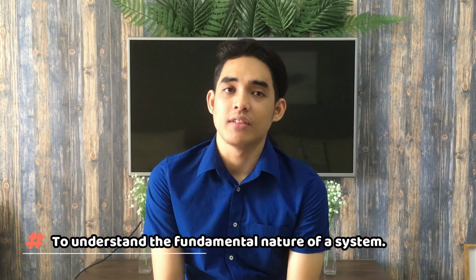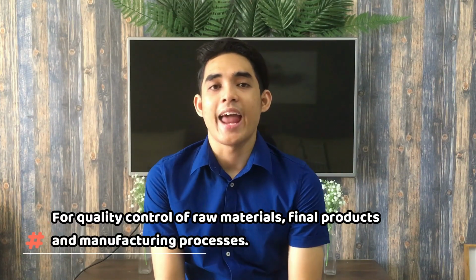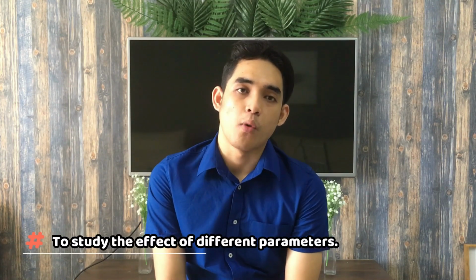Generally, rheological measurements on pharmaceutical materials are performed for the following reasons. First, to understand the fundamental nature of a system. Second, for quality control of raw materials, final products, and manufacturing processes such as mixing, pumping, packaging, and filling. Last but not least, to study the effect of different parameters such as formulation, storage time, and temperature on the quality and acceptance of a final product.